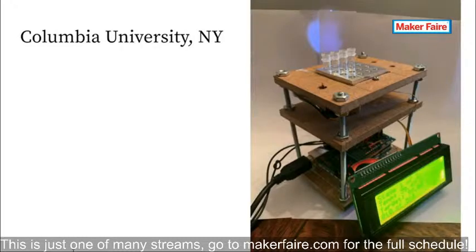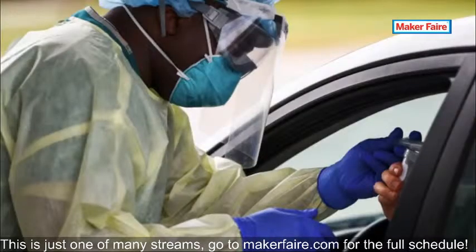If you are a member of a local hackerspace, you may already help healthcare workers by making PPE like face guards. But maybe we, makers, can do something more. Who needs affordable LAMP or qPCR machines? They have great potential to solve so many problems worldwide.